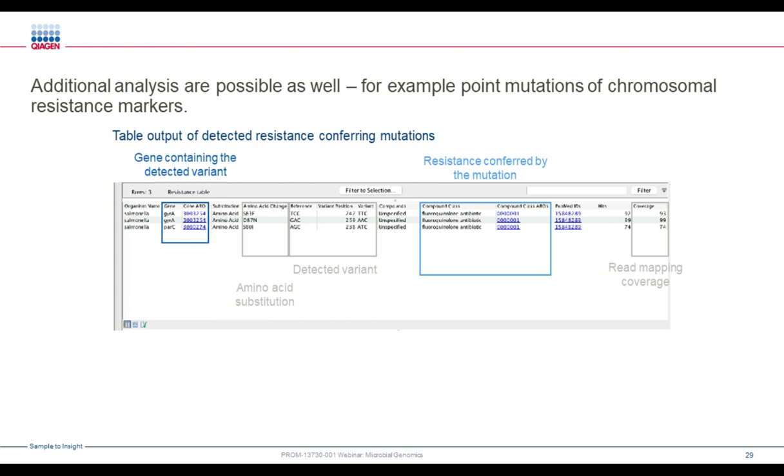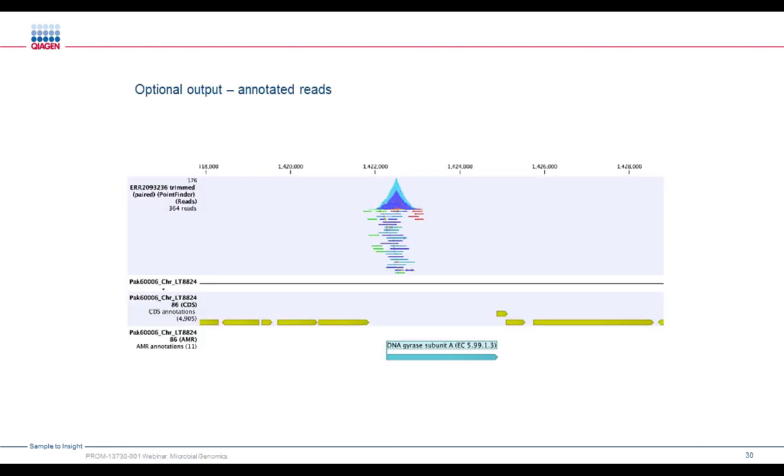And these databases include all of the SNPs and other variants that are associated with resistance, as well as the different compound classes and resistance phenotypes associated with those individual SNPs. The Point Finder database is maintained by DTU in Denmark, and we provide a direct download for our users within CLC to take advantage of this excellent work that group is doing there.